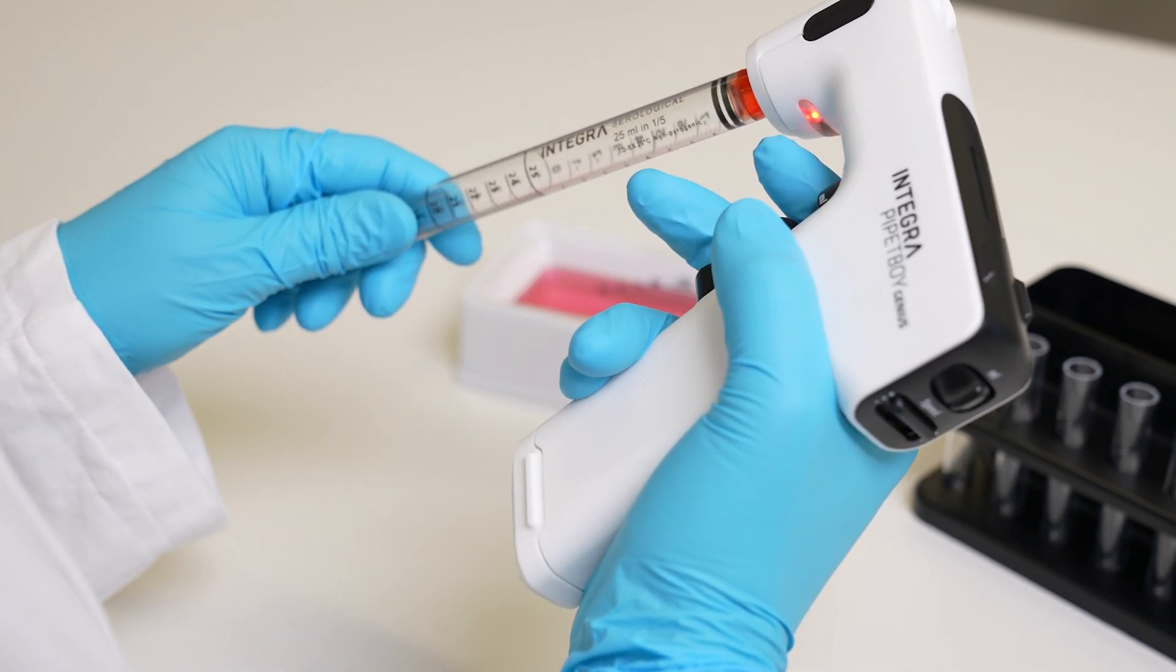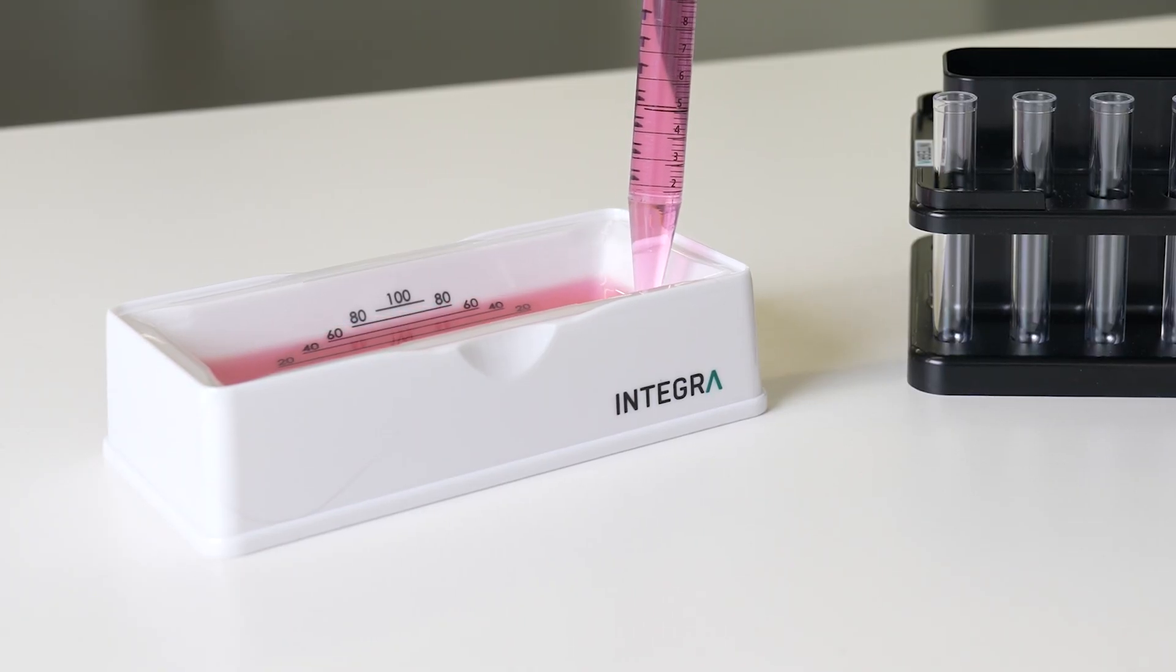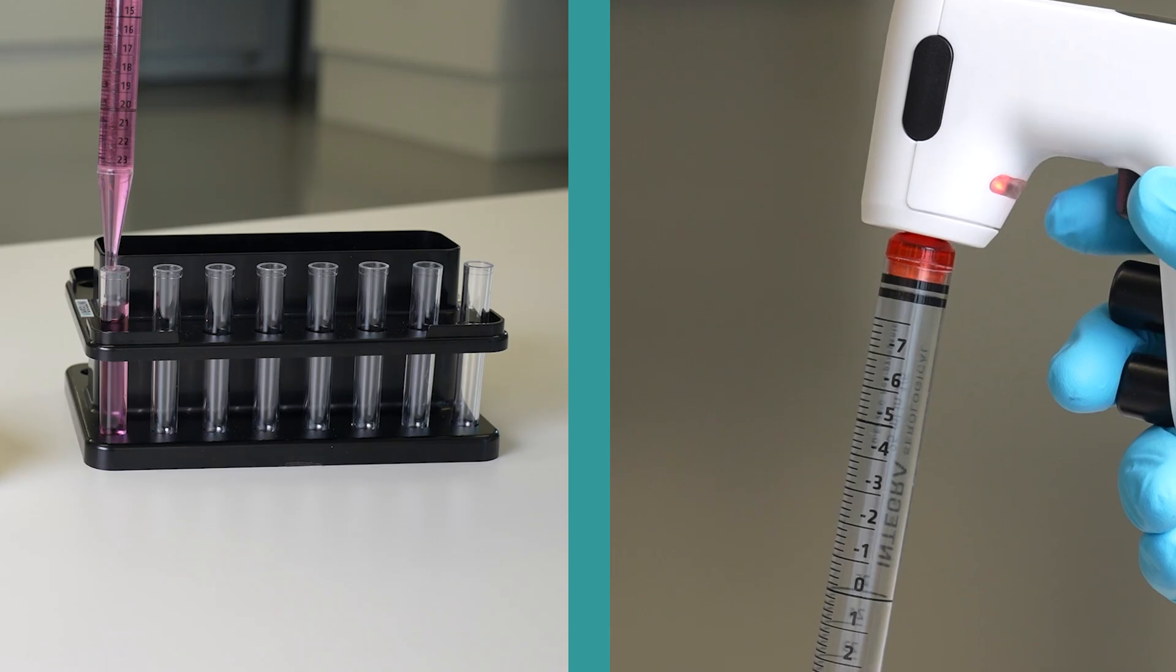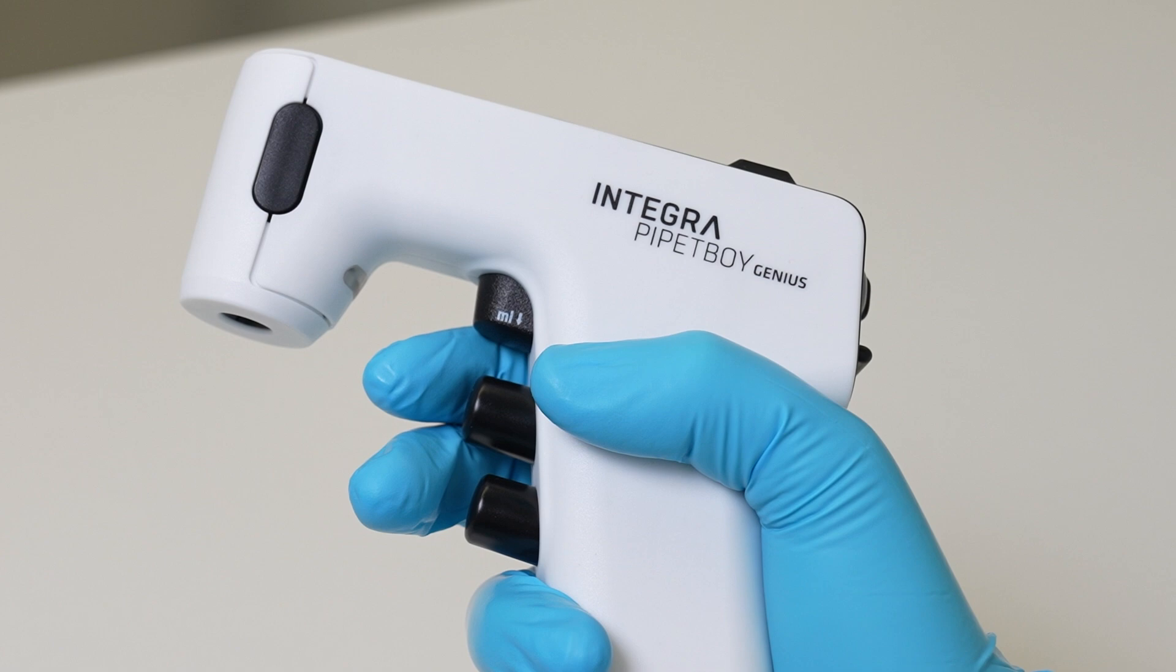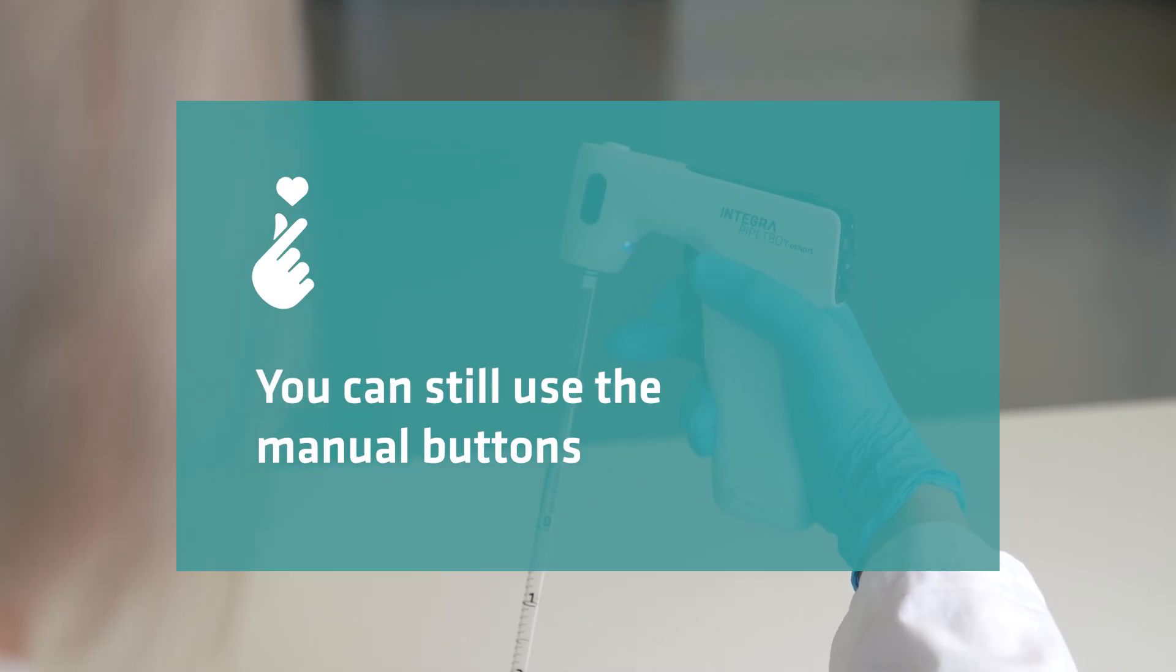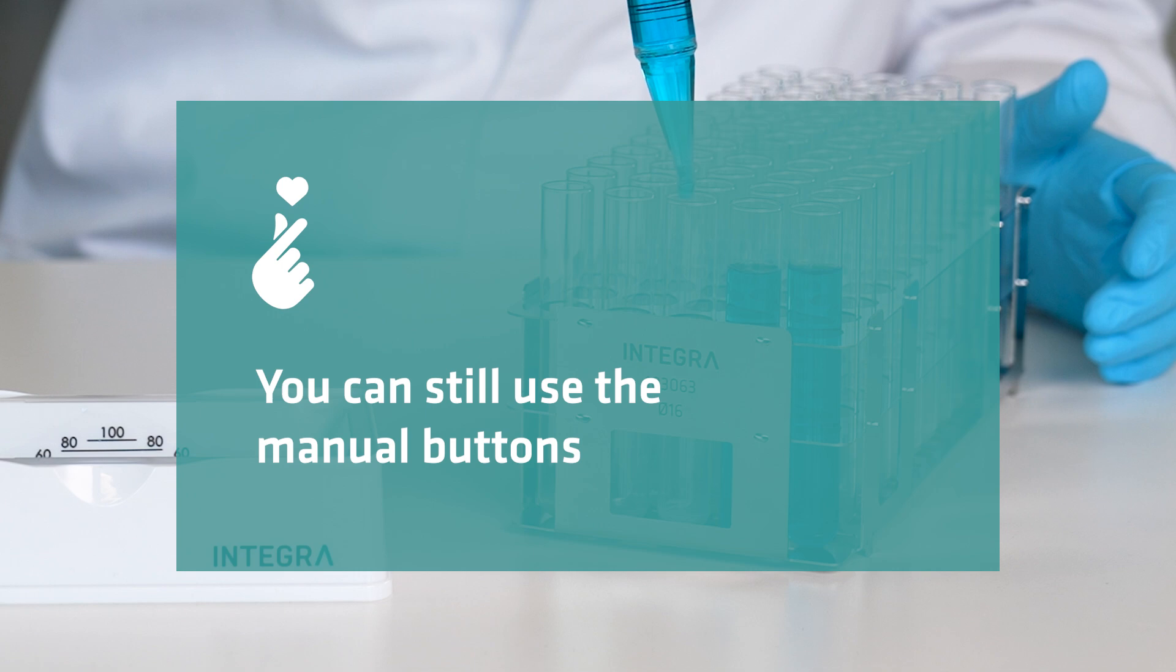All you need to do now is aspirate as much as you wish and simply press the repeat dispense button for each dispense. Just press the aspirate or dispense button to cancel a dispense if you've made a mistake. Just a heads up: you can use the aspirate and dispense button for your manually controlled workflow at any time.